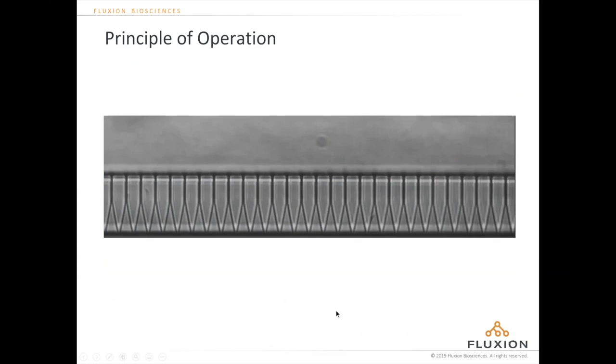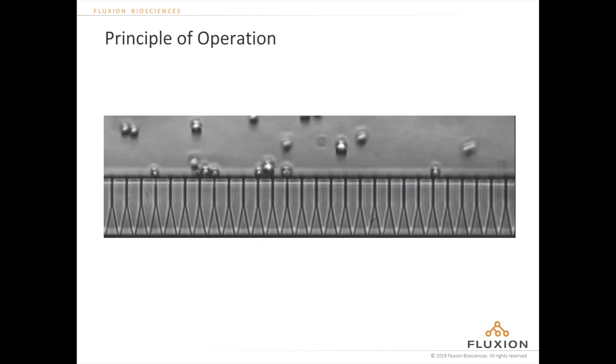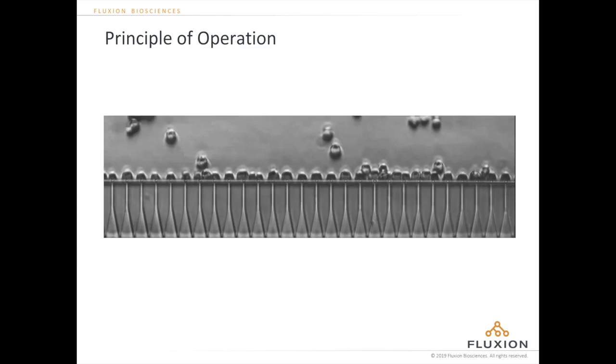This video shows the process of trapping the cells. The plates are actually transparent and access to them is very feasible. So in effect, you can shine light or record the cells while they are trapped. Here you can see the cells are flying by, then the flow is interrupted, they are trapped, then the flow starts again, and then new cells, and then they get interrupted again. Basically this keeps on going until all of the holes are covered. And you can see afterwards how the flow just continuously goes. Here we go, flow is moving.